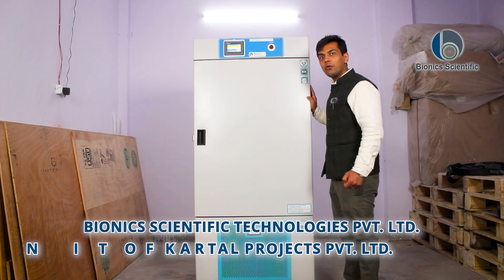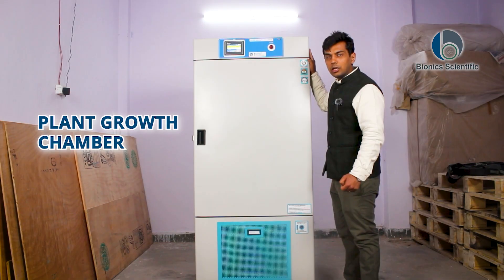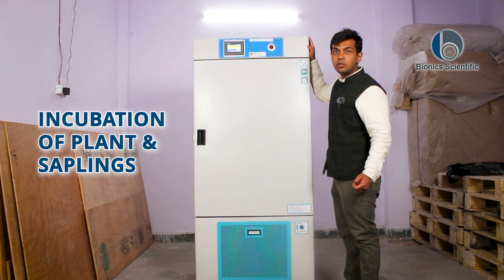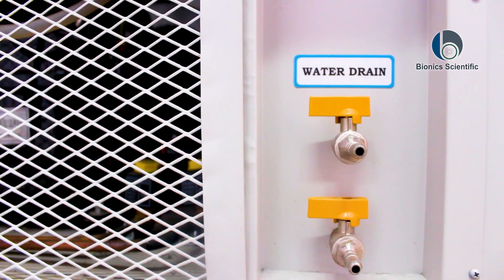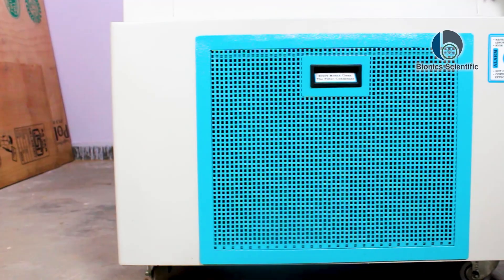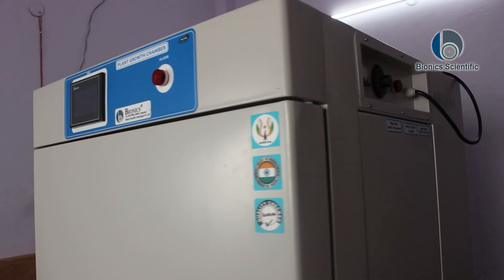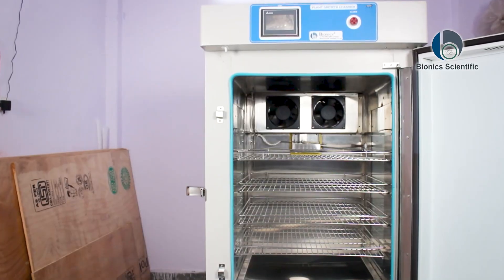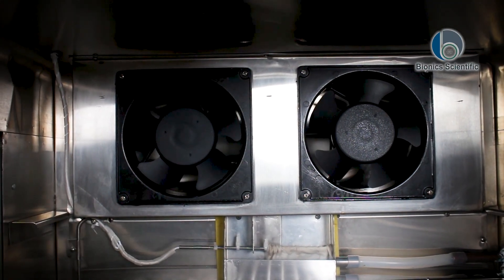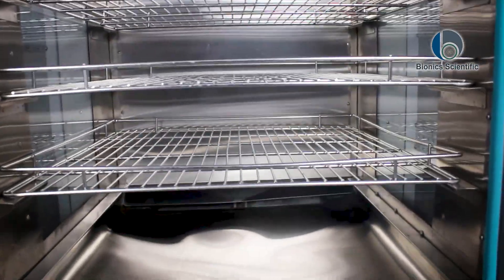Today we are going to present our new product — the plant growth chamber. The use of this plant growth chamber is mainly for incubation of plants and saplings. The plant growth chamber size is 300 liters. It contains illumination of 23,000 lux. If you open it, you can see there are two circulating fans present inside.